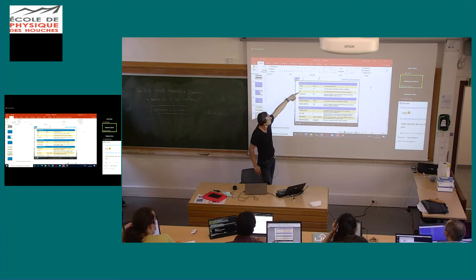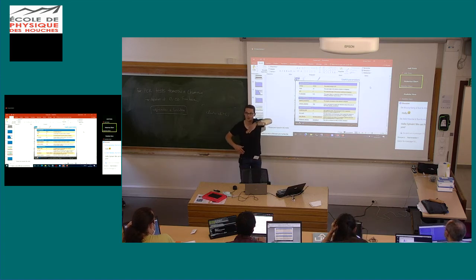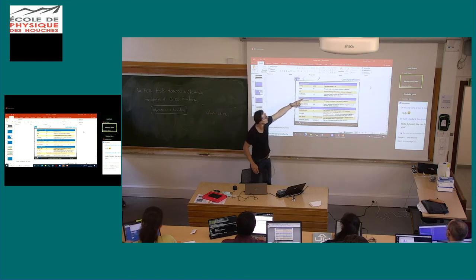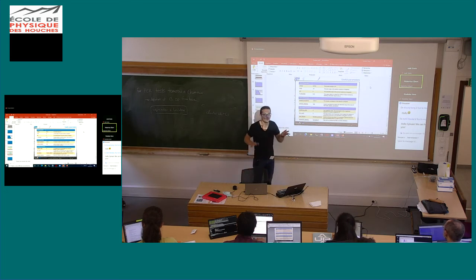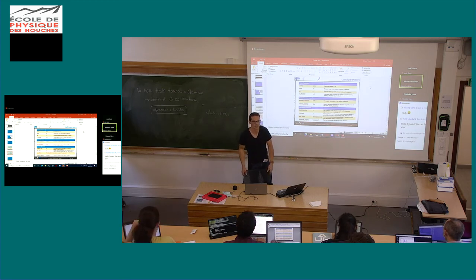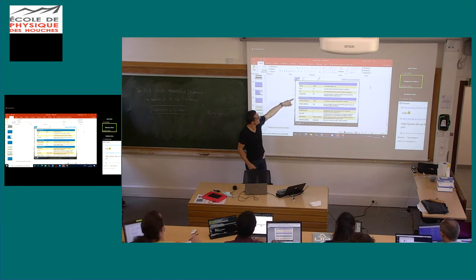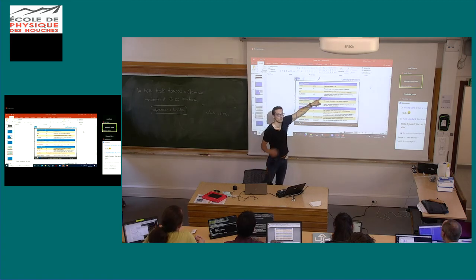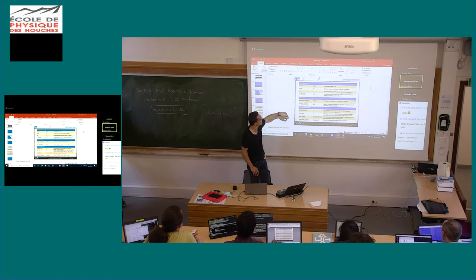The theta and phi angle, so this is the position of your light according to the origin. Okay. So this is the geometry. I'm not sure this is our geometry, but normally most of the spectrometers share almost the same geometry. Sometimes it's more or less. And then, no, sorry, copy-paste error. There is no TL threshold. Of course, it's in the previous parameters, so this line doesn't exist.